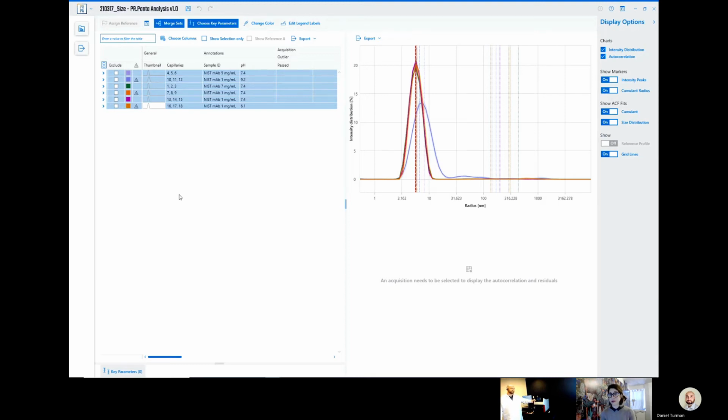We may have to stop this in just a minute. That's okay, to move on to the thermal. But before we do that, I want to show you the results of this. And I think it's really cool.